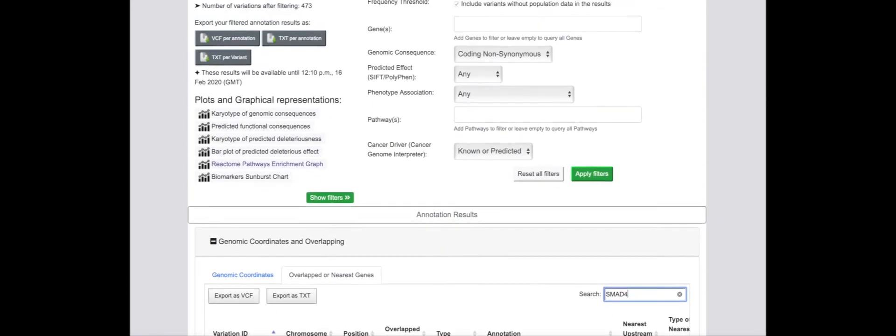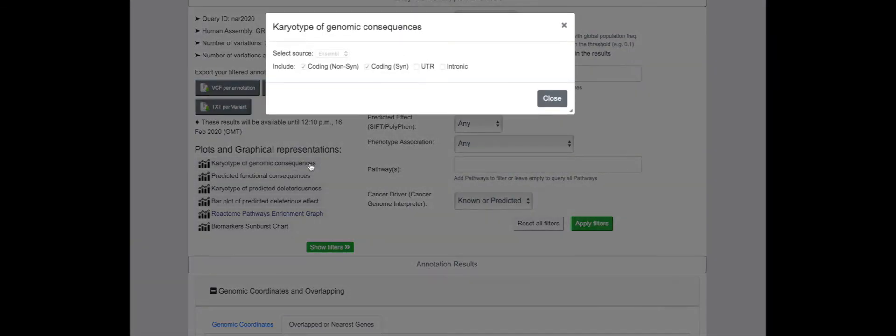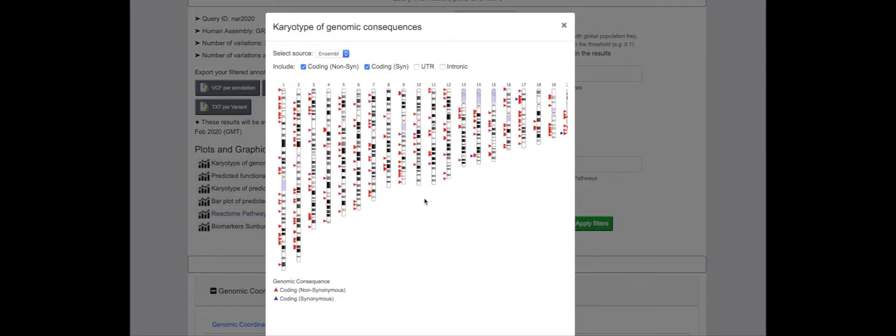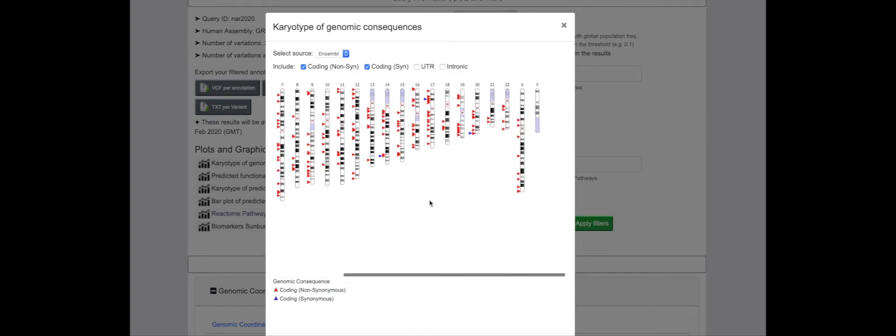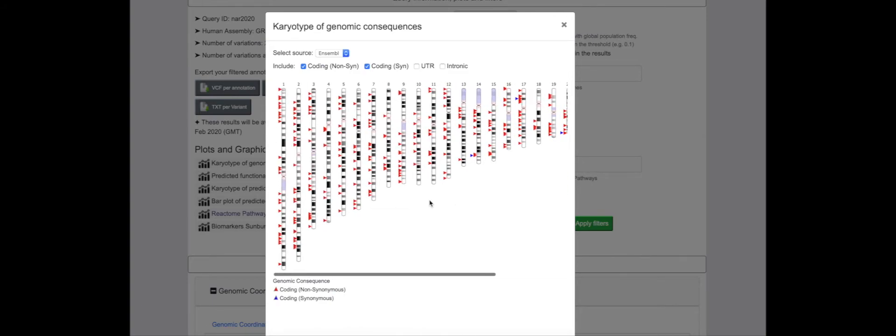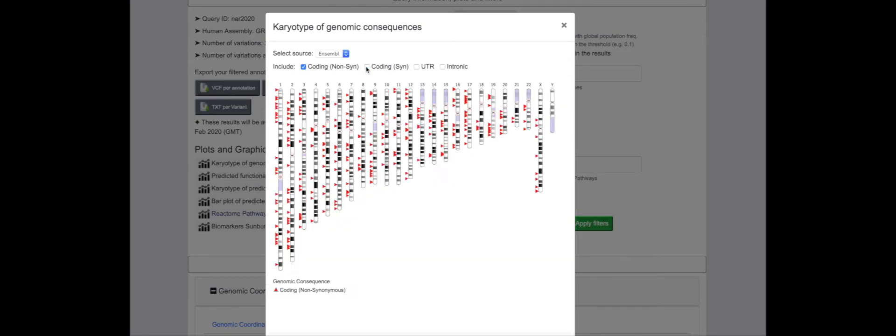The range of interactive plots provided by SNPnexus include a karyotype plot representation of the location of input variants across chromosomes, with distinguishing colors used to identify different classes of coding mutations. This makes it easy to identify mutation hotspots where clusters of non-synonymous coding variants are often found.